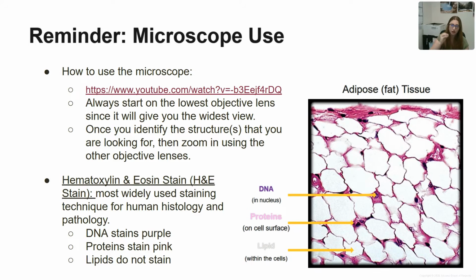You never want to start at that most zoomed in level, because you're going to be searching that plate all over all class trying to find what you're looking for. So always start wide, start with your eyes at the park, find the bird, and then put the binoculars on and start looking more closely, more zoomed in.